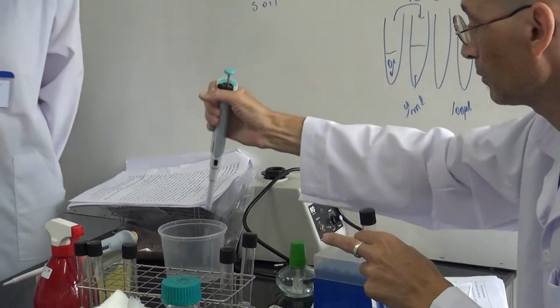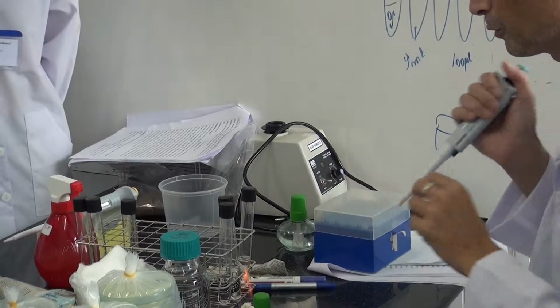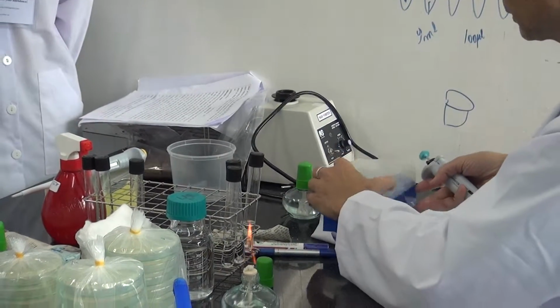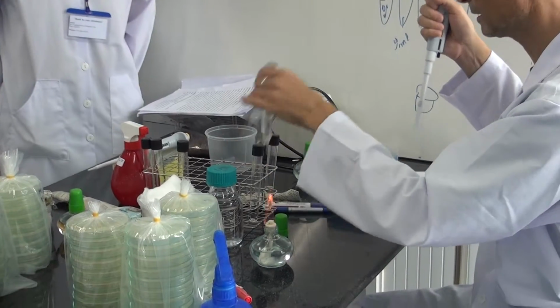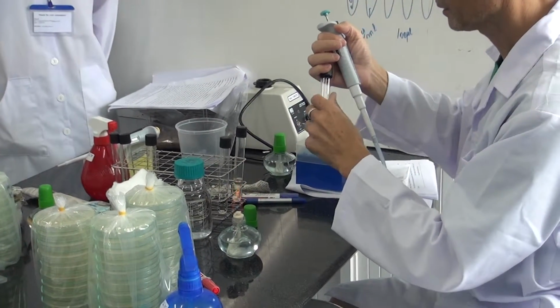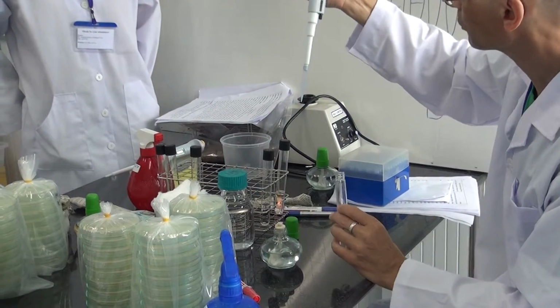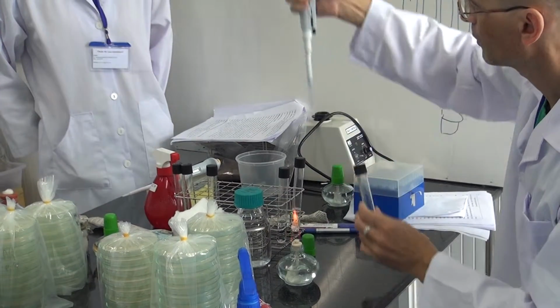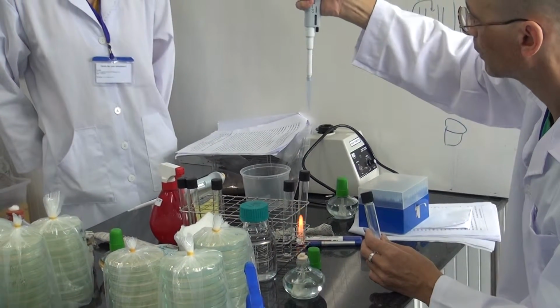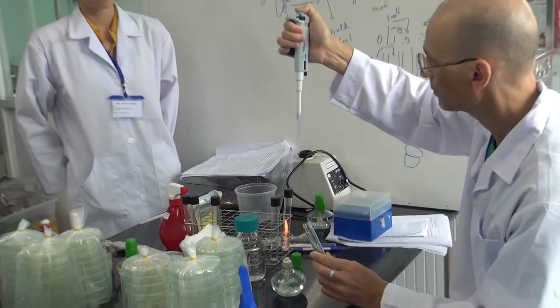Okay, so you throw the tip away. Okay, just to remind you for those who may not remember, when you take a sample, you push. You have two steps. 1, 2. Okay, so when you take a sample, you just push to the first step.